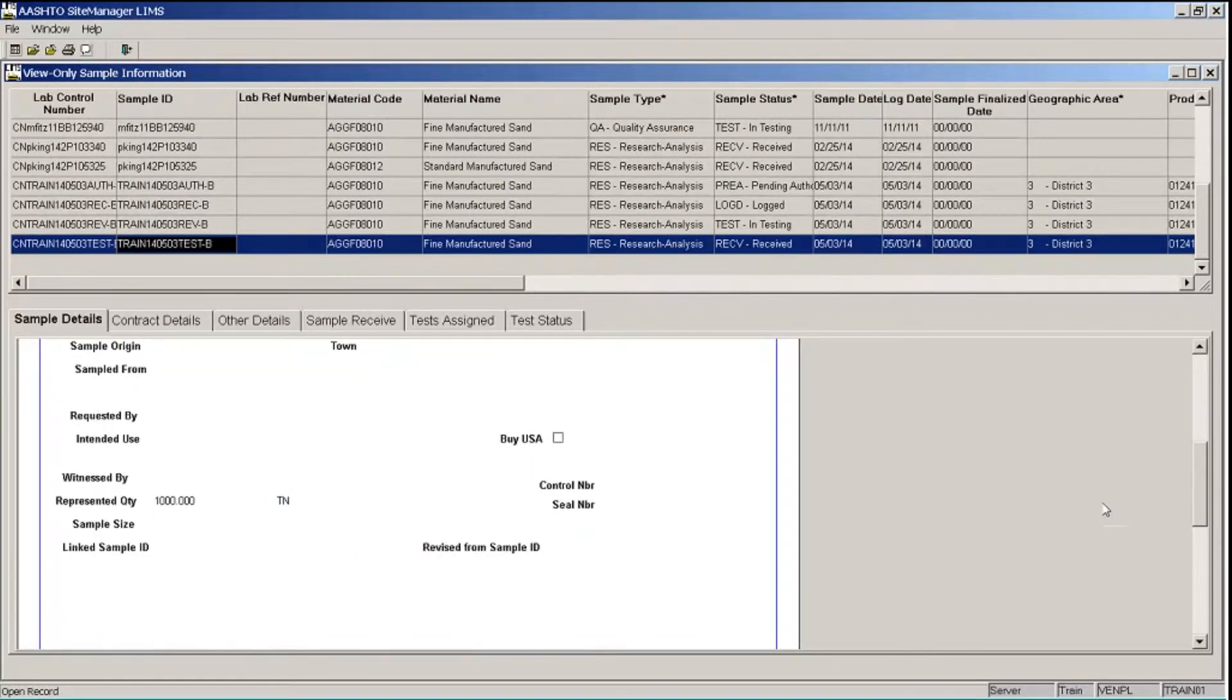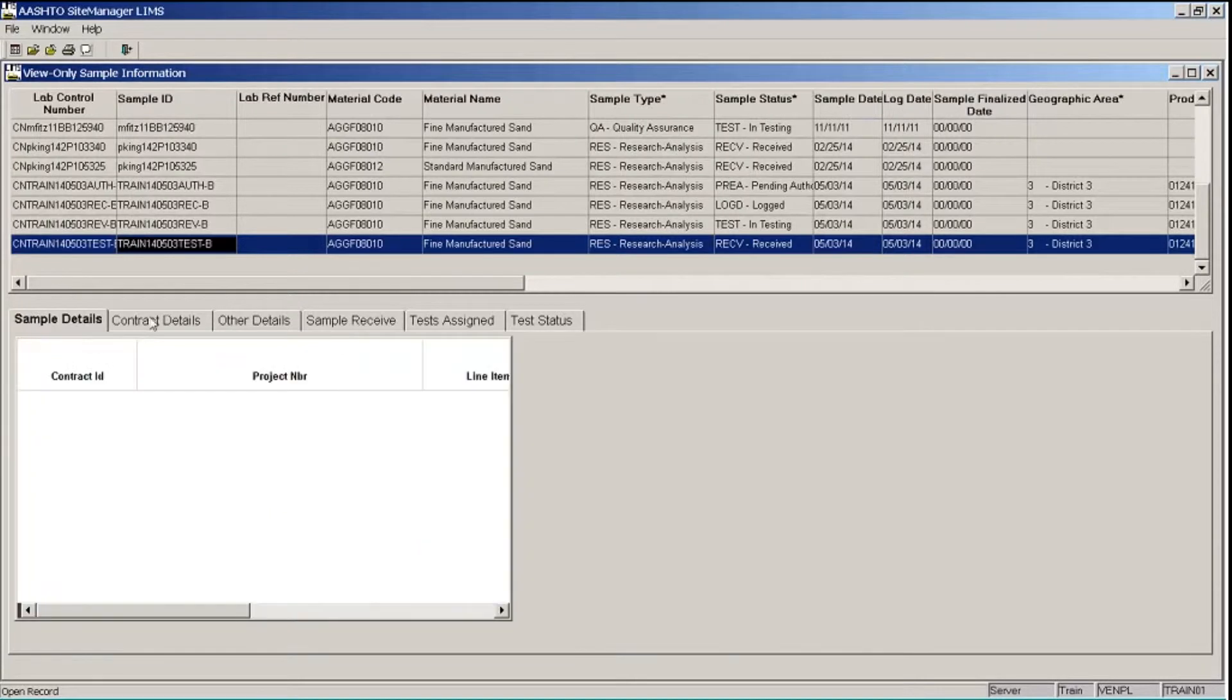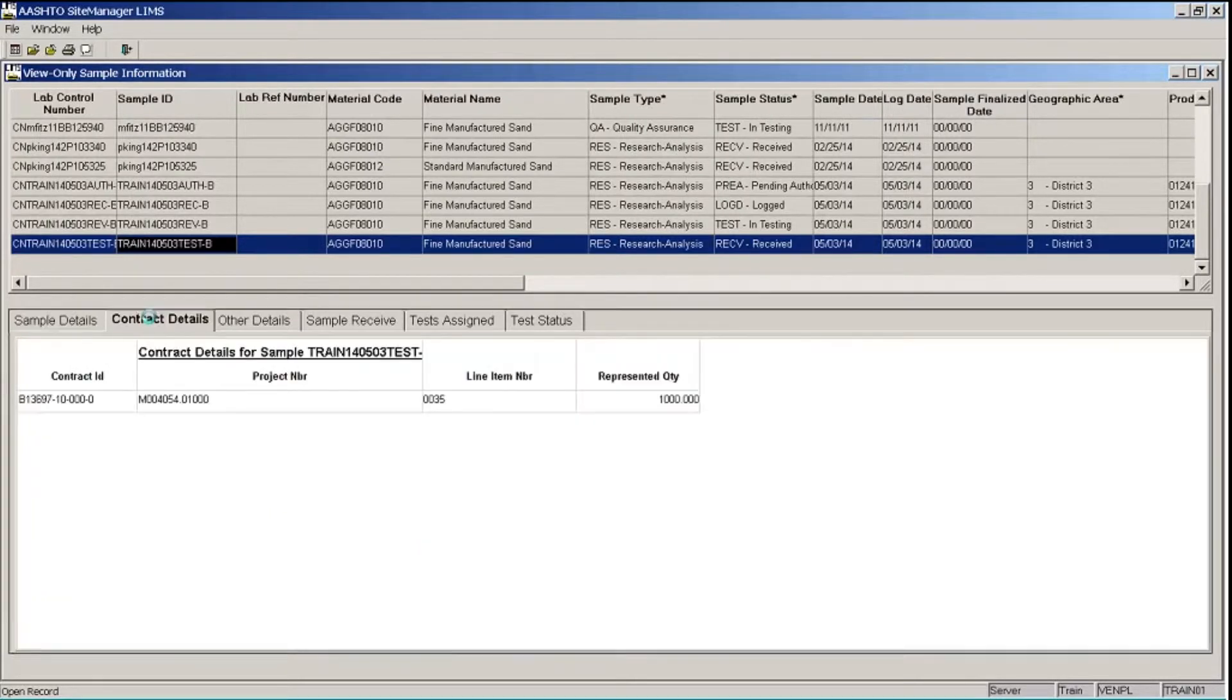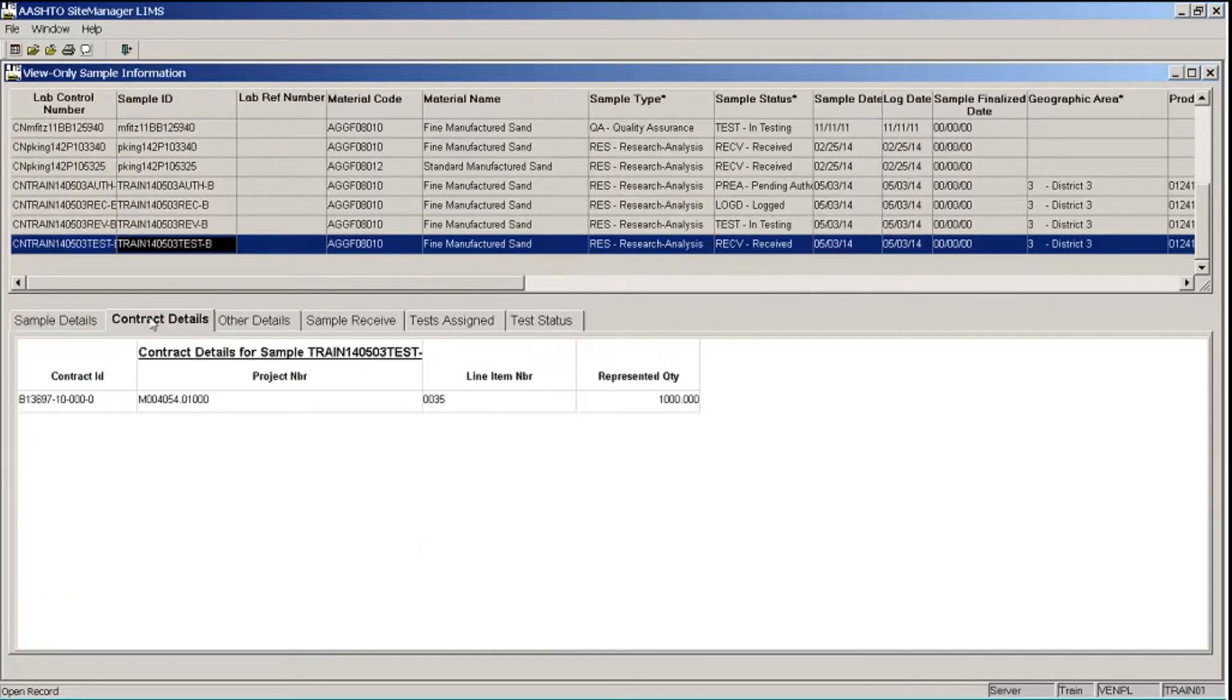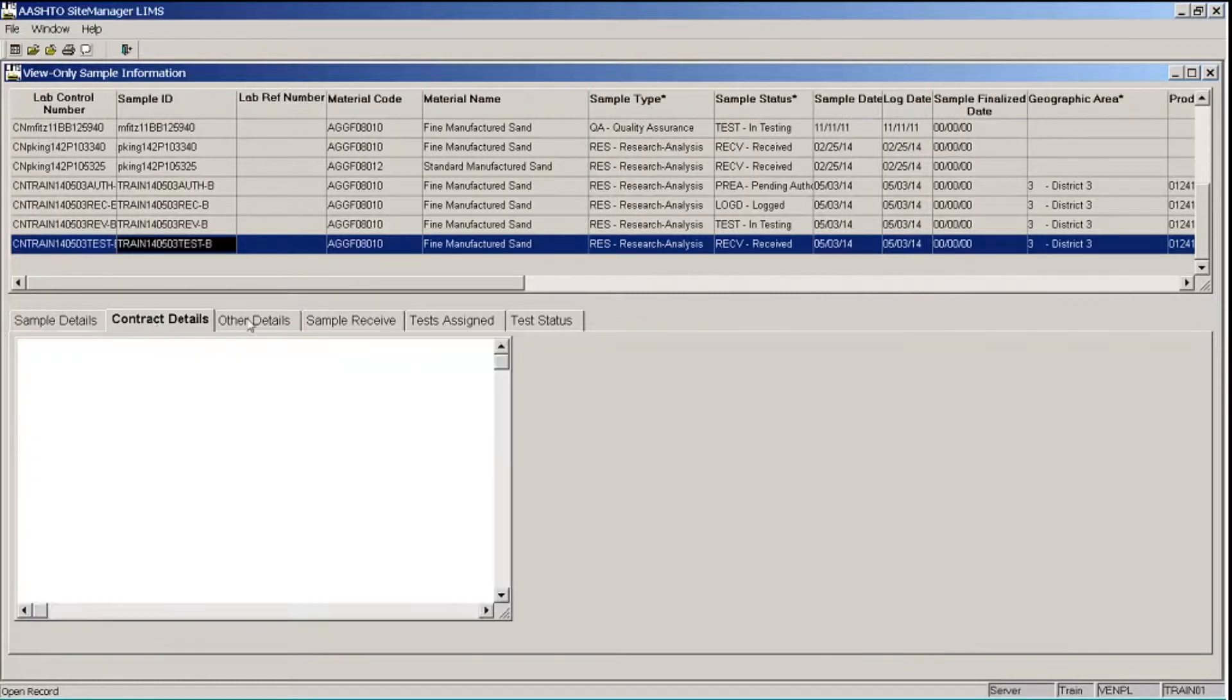I'll click on the Contract Details tab, and this will show the contract and or contracts and items that are associated with my sample record.